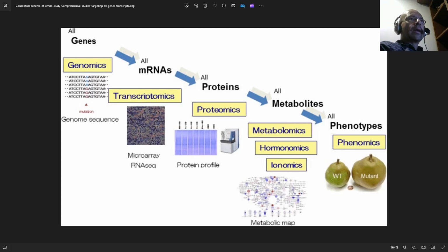Hello everyone, I am Herbert and today I will delve into the fascinating world of identifying key genes using differential expression analysis in the transcriptome file. Let's start with some context.